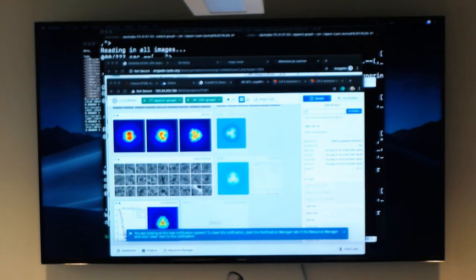The thing about this one is you can always choose there and set up the workflow and the run, and the data is at the... yes, it's definitely okay. Probably should have put this through.